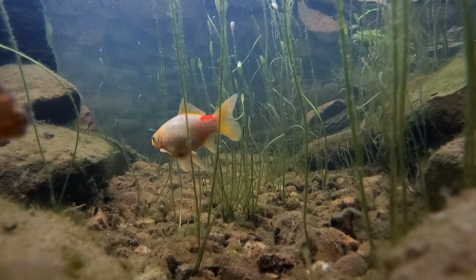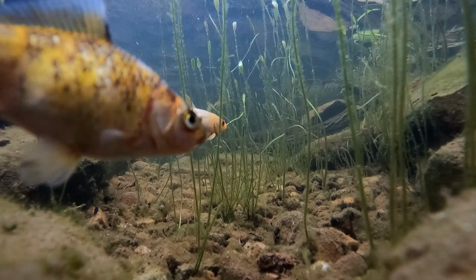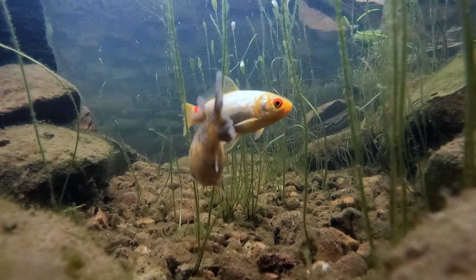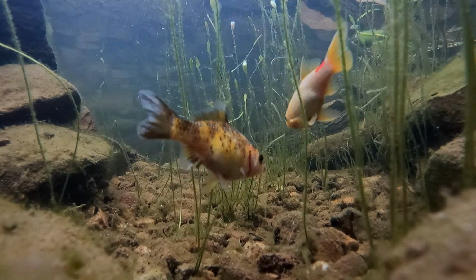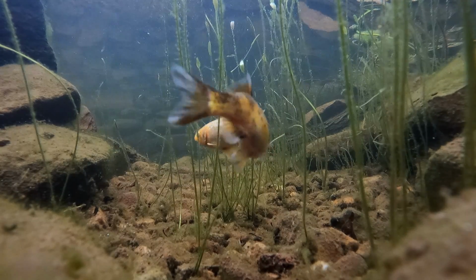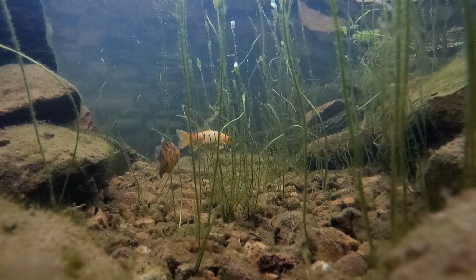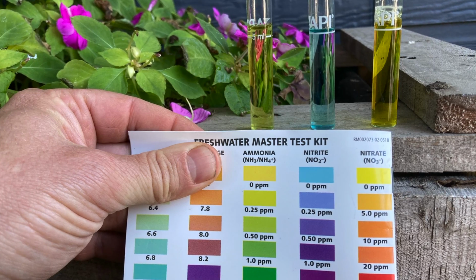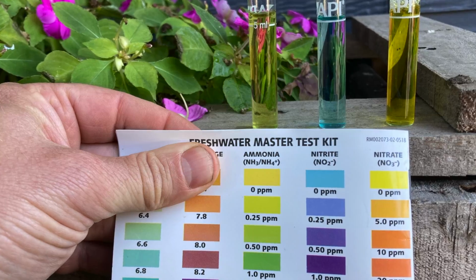An interesting thing that I notice when you test ponds with algae is that you still get the same readings as ponds without, and I suspect it's because the algae is using up those nutrients. Algae grows incredibly quickly, so when the nutrients are available, it uses them to grow. Then as the nutrients are no longer available, it slowly dies off. But that means you hardly ever find them in the test kit readings, at least not in the cheap API test kits that I use.